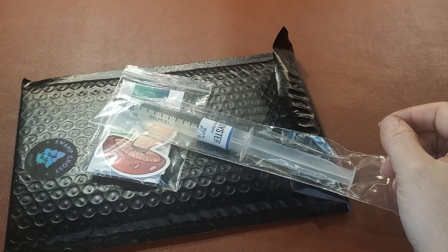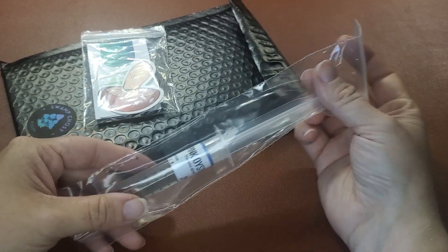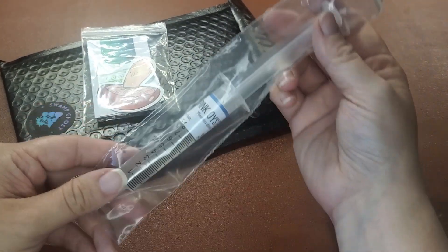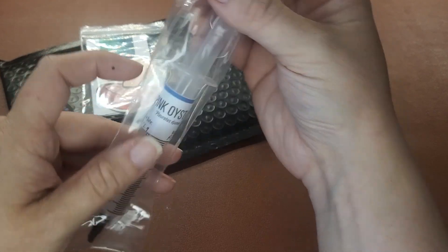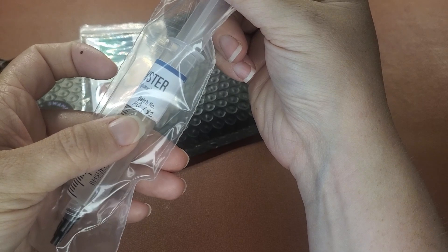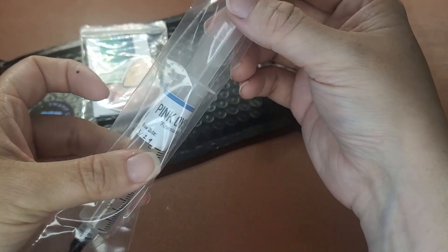Whenever you order one of my syringes, it'll come to you in a package very similar to this. There are two things you're going to want to look for inside the package. One of them is this syringe itself. It'll include the draw date and the batch number. This batch number is important for me if I ever have to look up the genetics on your order if you have any questions about it.